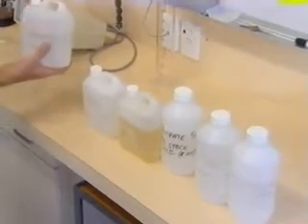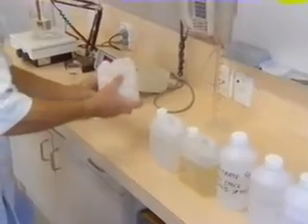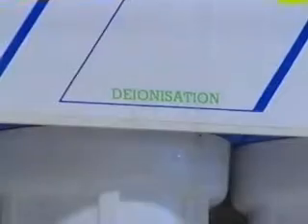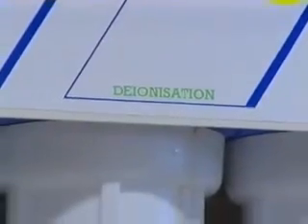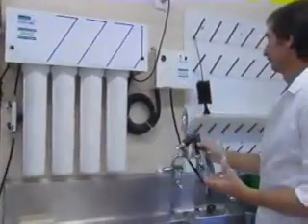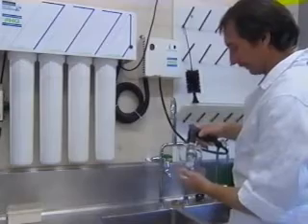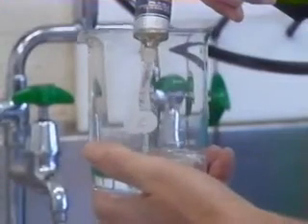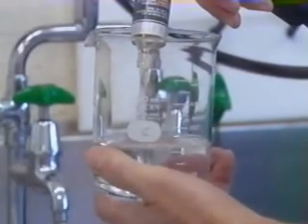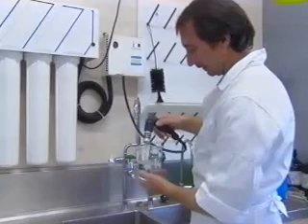To prepare media, simply measure the quantity of stock solutions or add the correct amount of powdered medium to deionized water. It is important that the water used for tissue culture be deionized. Deionized water can be purchased from many supermarkets or water purification companies. Large laboratories normally have their own purification plant.